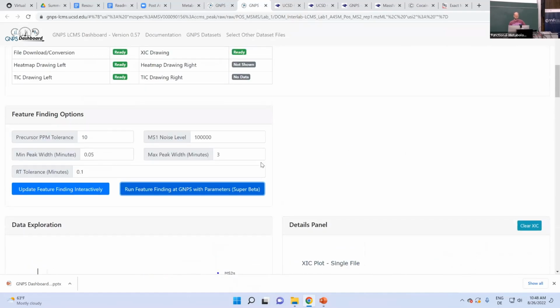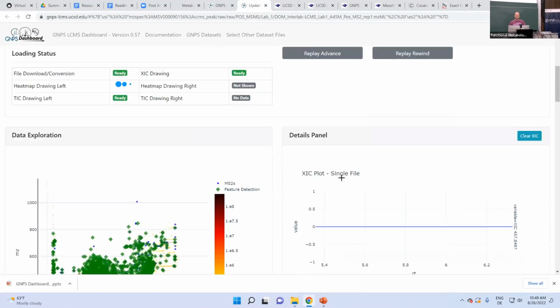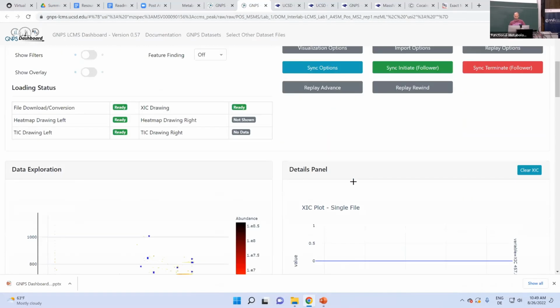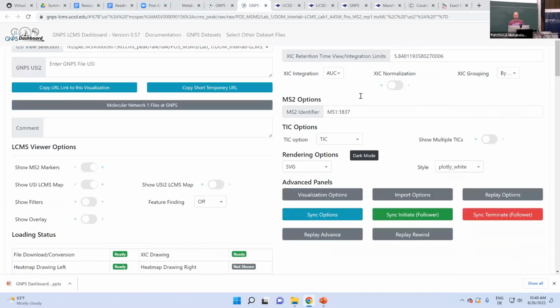Okay, now we did the feature finding and everything, but maybe you were not interested in that, and you just wanted to showcase the results of cocaine, because that was now the most important feature you found, and you want to convince somebody to be a drug addict, and now you want to put this in a report, so you can visualize the XIC.